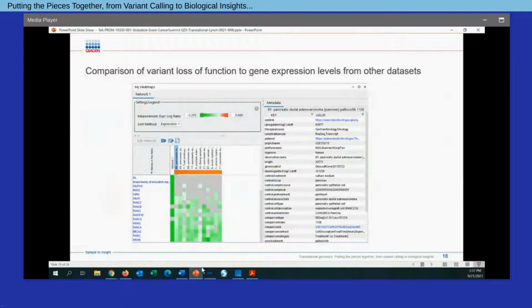And so what we're looking at here are kind of the end results of the analysis that I did on this set of gain or loss of function variants in the cohort of Lynch syndrome patients, where essentially we're looking at a heat map here. And within this heat map, we have our set of genes. This first column here represents the cohort itself of my study. And within this cohort, we can see each gene has a green colored cell that represents a loss of function in the set of genes here. Again, MLH1, a lot of FANC family of genes. We can see BRCA2 as well.